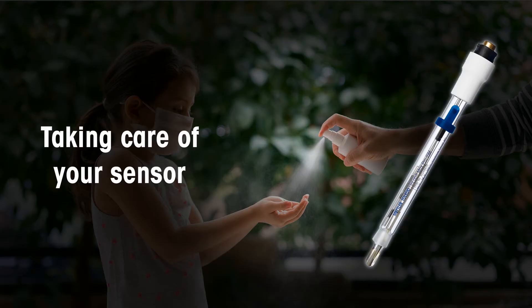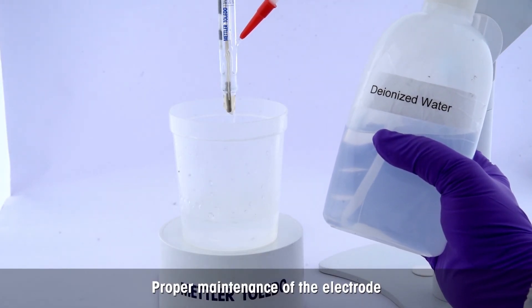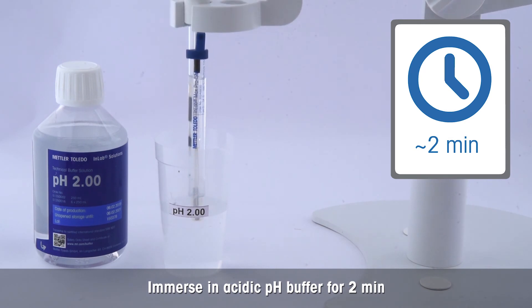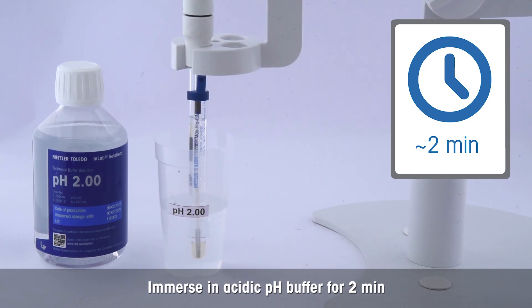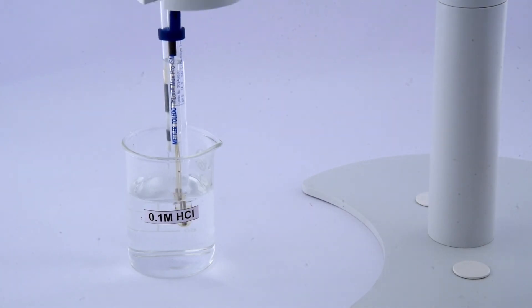Here are some tips and hints to ensure quick and accurate results. For thorough cleaning of sample residues from the electrode membrane after measurement, clean it with deionized water after every measurement. After cleaning, condition the pH sensor in acidic pH buffer for two minutes. This helps to replenish the pH-sensitive membrane after its exposure to the solvent-based sanitizer sample.